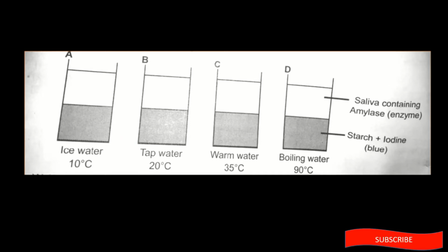And then another question is, why do we have starch plus iodine? When you did food tests, you know that iodine tests for the presence of starch. Iodine is yellowish to brownish in color. And when do you get a positive reaction? When starch is present, your iodine solution will change from yellow to blue.